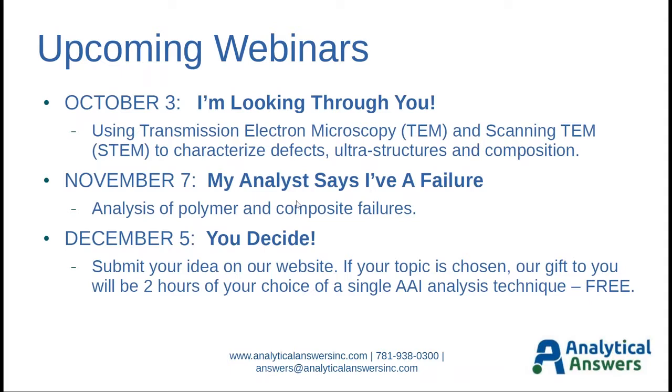Would the STEM-EDS or Auger techniques you showed tell me about other samples like this, like ceramics and oxide layers or polymers? Auger works best on conductive materials because it is an electron beam-based technique, so it doesn't really work well on ceramics or oxide layers on polymers, and so Auger has a hard time with those because of sample charge buildup. However, we do have another technique called XPS, X-ray photoelectron spectroscopy, which also does depth profiling and is equally surface sensitive as Auger.